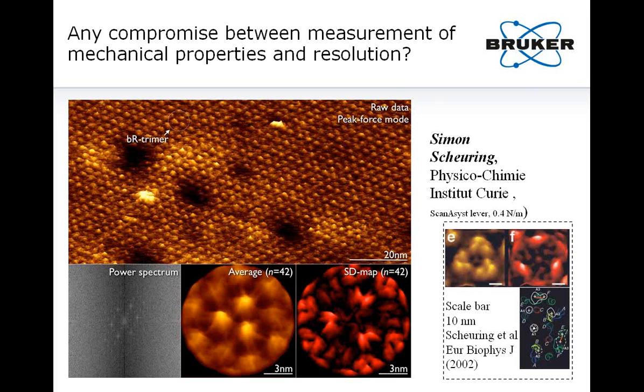So it typically assembles into 2D patches that can cover approximately 50% of the membrane, and it's found most of the time in archaeal cells. So they form trimers, and were first imaged in contact mode in the 90s, and then in tapping mode later on.